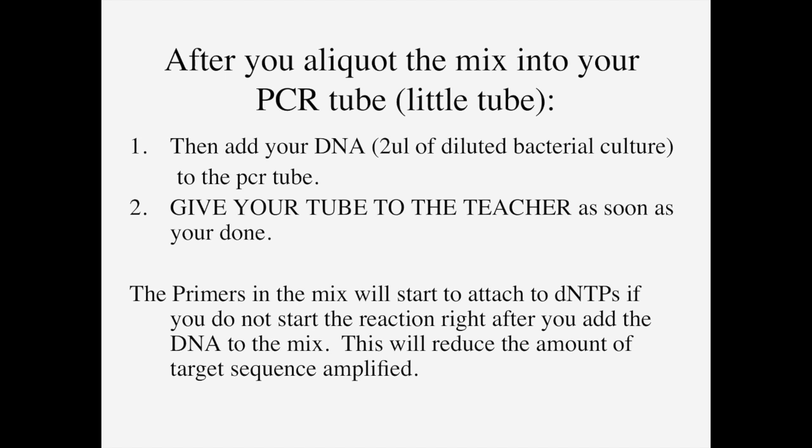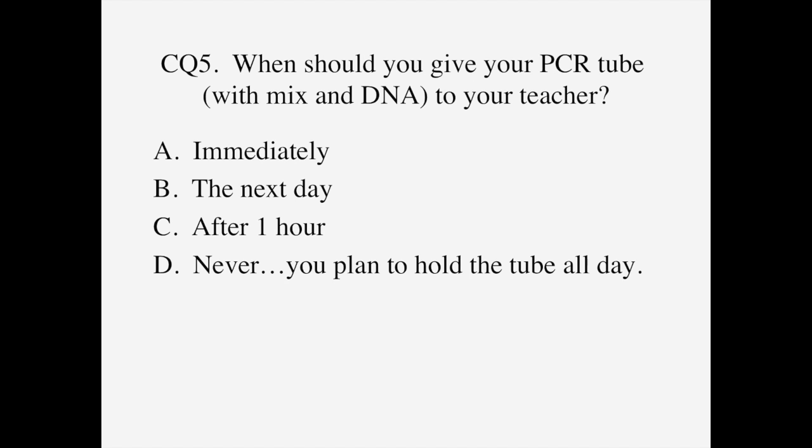Okay, the primers start to attach the nucleotides. If you don't start the reaction right after you add the DNA to the mix, then you really are going to start to reduce the amount of target sequence that's amplified. It's just going to start adding nucleotides. So we want to actually denature the DNA and make the reaction work the way it's intended.